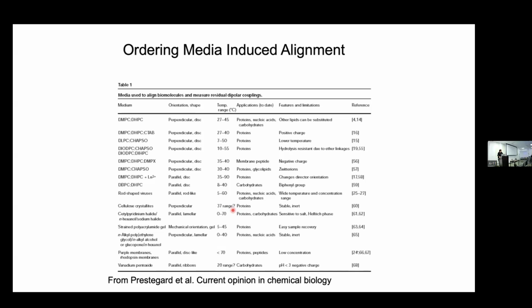So what's the most reasonable mechanism for alignment? As Art said, there's a wall in the NMR tube. Does that induce alignment? Apparently it does a little bit. So why would the presence of an aligned thing transmit to a solute which itself is not aligning?